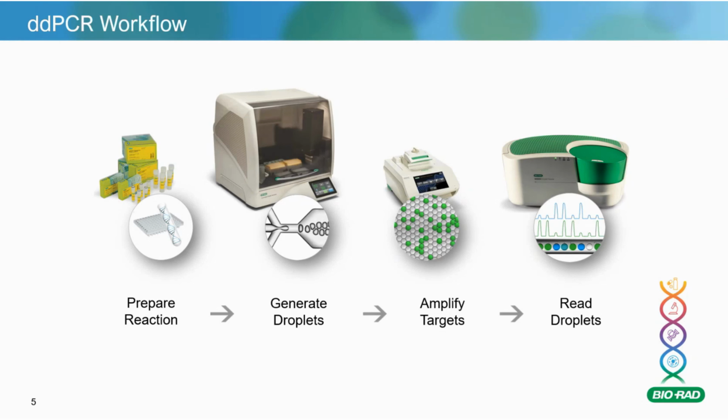So when you're doing droplet digital PCR, it's basically like doing real-time PCR. In fact, you can use real-time PCR assays most of the time. And with the Bio-Rad system, we're running it on a 96-well plate. It's a standard 96-well plate, something you should be very familiar with if you do any sort of PCR. Now, this is the difference. That 96-well plate is then required to generate droplets, okay?